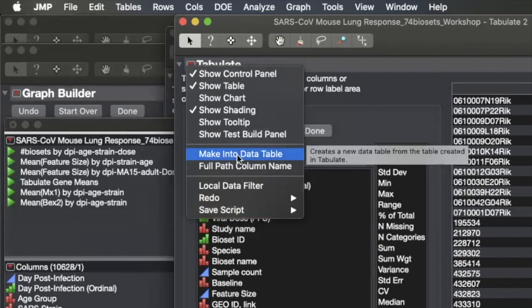I have a quick question. Sure. Do you want us to proceed after filtering out the 0 on the DPI or not? Yeah, go ahead. You're going to get the same answers no matter. The numbers are going to be a little different, but the order should be the same. Yes, let's just use the one you did that does not have the 0 in it. Awesome. Thanks.